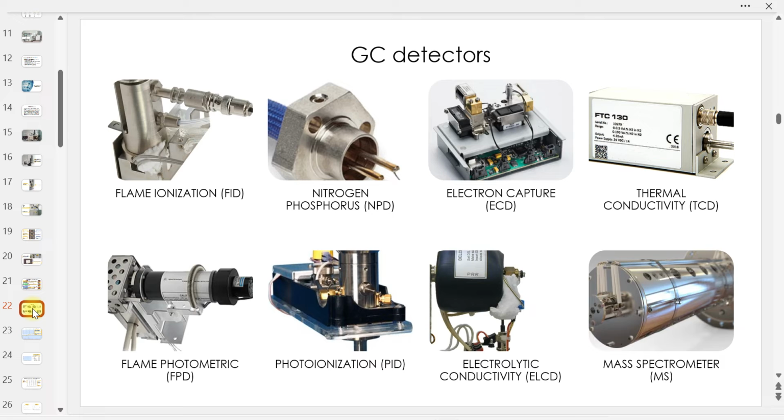Okay. So GC detectors dulu orang pakai ni common FID, flame ionization detector. Yang ni ada dekat UPM juga. Cuma again, all of this hanya mass spec sahaja yang ada library. Yang ni semua tak ada library. That's why you tak susah nak jumpa yang lain-lain ni lah. Yang common ada ialah FID dengan MS. Okay, selain itu saya sebut juga lah nitrogen phosphorus NPD, meaning be able to detect focusing on nitrogen, compound that containing nitrogen and phosphorus only.